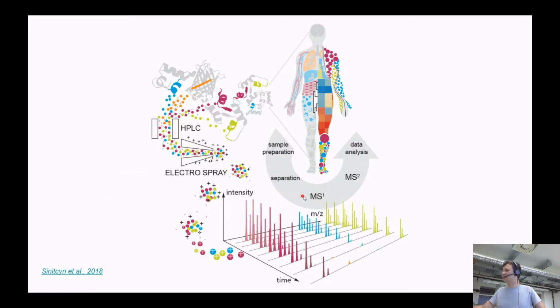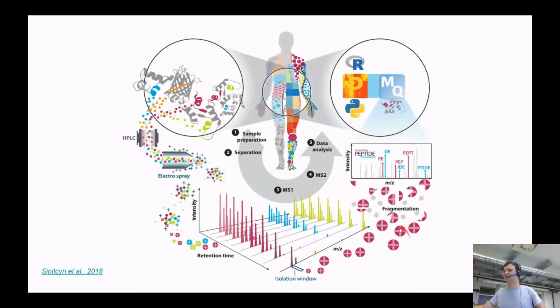So we are doing some instrument inside instrument fragmentation. What I mean by that, we can isolate certain species of the peptides. Let's say we see from the first MS certain sets of the peptides, and now I'd like to analyze this specific peptide with this specific mass to charge range. So we can trigger some activity in the instrument so that it starts collecting all peptides from this isolation window. After collecting all these ions, we can actually make fragmentation inside of the instrument.